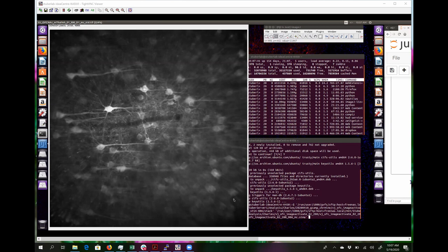Either you could be very strict and then just not draw anything on the periphery. I actually do draw them, but I draw them in a way whereby I'm fairly certain that it's not overlapping with other ROIs, and I can kind of show you how I do that.